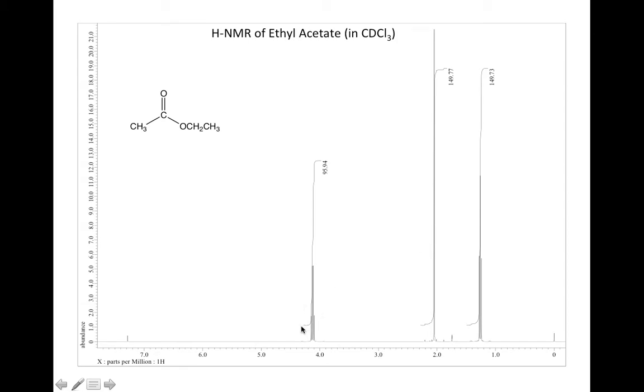Now also on the NMR spectra, you see this funny little line here. This is the integration, which is telling you the area under these peaks, and that, it turns out, is directly related to the number of protons, so that's going to be very useful for us. In this little video, I'm just going to go through the simple analysis of this NMR spectra to get you back up to speed.